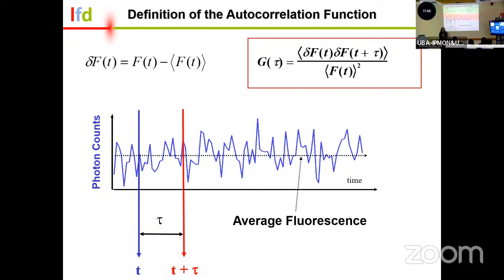Similar to blinking and not getting the number of molecules at that time, right? It doesn't matter because statistically, we're going to get a correlation function. We can't cut it too short because we need to get enough statistics. But if we have a long trace, we can cut it in multiple segments to generate autocorrelation functions for the statistics.